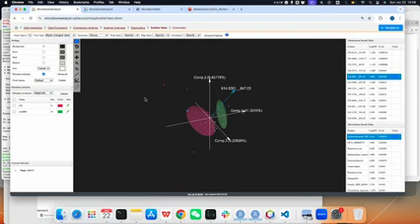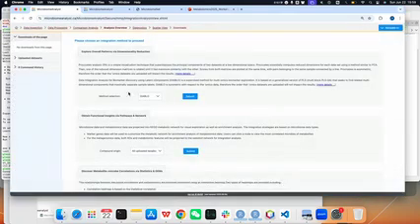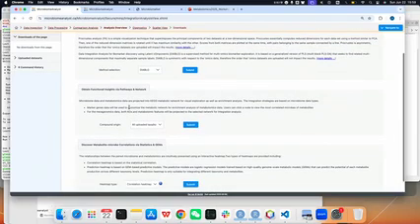Do you have any questions about this part? Okay, if not, we can go to the next analysis. The next two both include the function part. This one is the customized network.